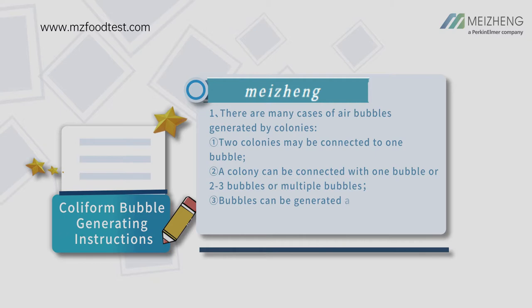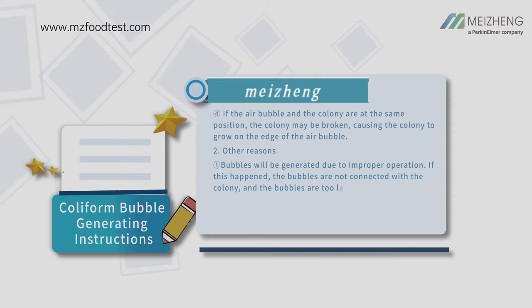Two colonies may be connected to one bubble. A colony can be connected with one bubble, two or three bubbles, or multiple bubbles. Bubbles can be generated around the colonies and are not connected to the colonies. If the air bubble and the colony are at the same position, the colony may be broken, causing the colony to grow on the edge of the air bubble.